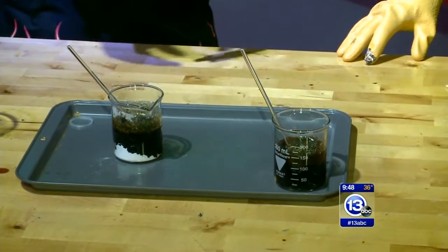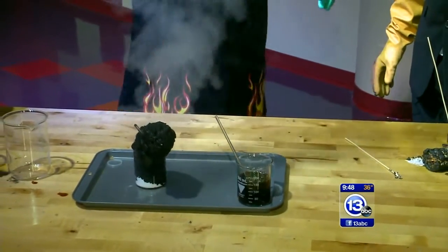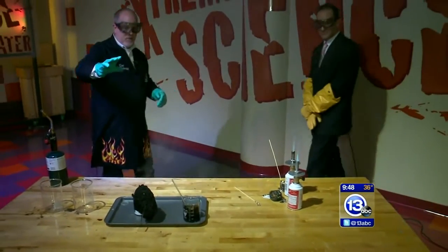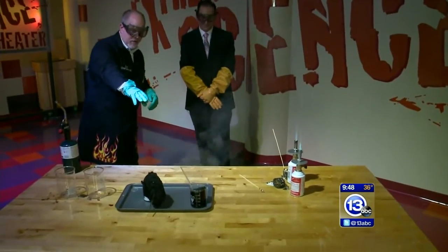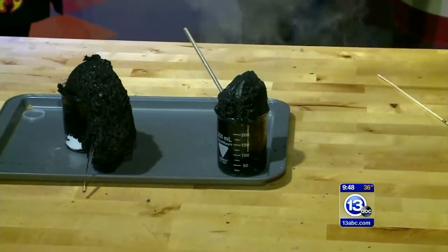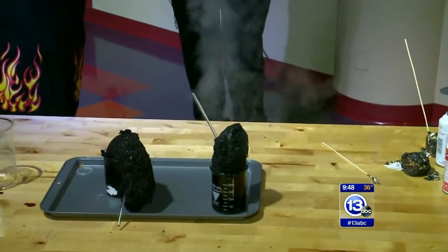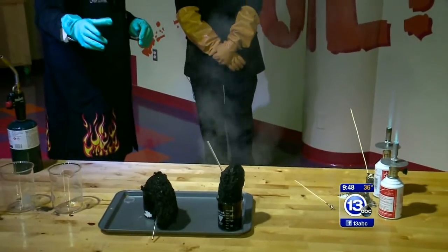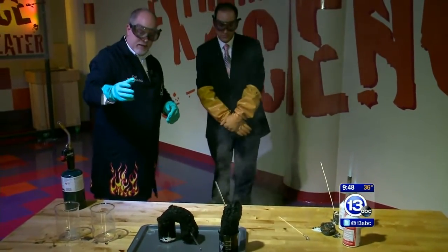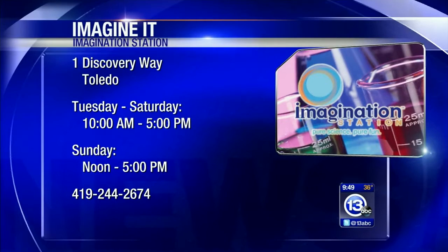We're breaking down that sucrose — it's an exothermic reaction, so we're generating heat. We're taking the water away and all that's going to be left over is the carbon from the sucrose. That's like one of those fireworks snakes. That steam coming out might have a little sulfuric acid in it as well. It's just like when you burn your marshmallow too hot — we actually carbonized it. It's a really nice vivid demonstration of what happens when you push something a little bit too far and break that sucrose down to create carbon.